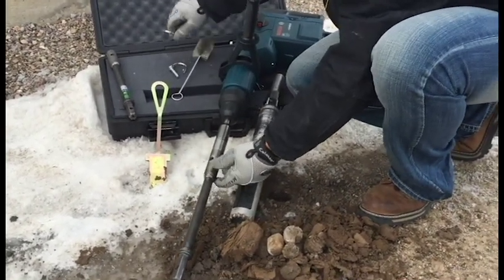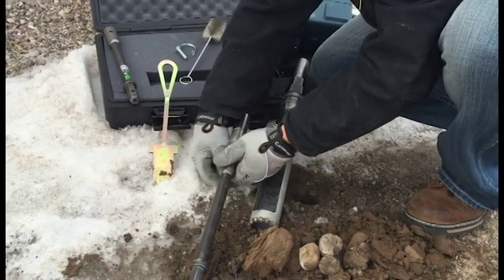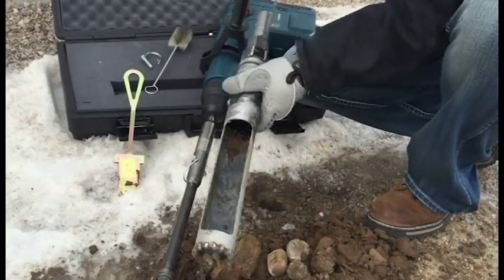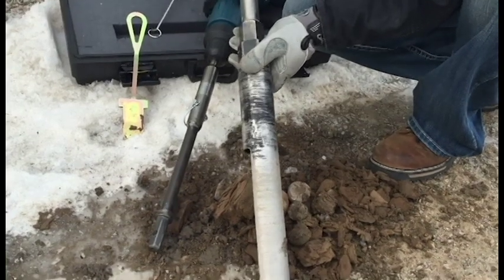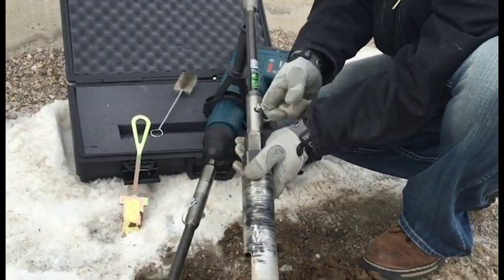Next, connect the adapter to the 1-foot hex quick pin extension rod using a 3/8 snapper pin. To achieve your target depth, multiple 1-foot extension rods may be used. Attach the 1-foot extension rod to the frozen core barrel using the 3/8 snapper pin.